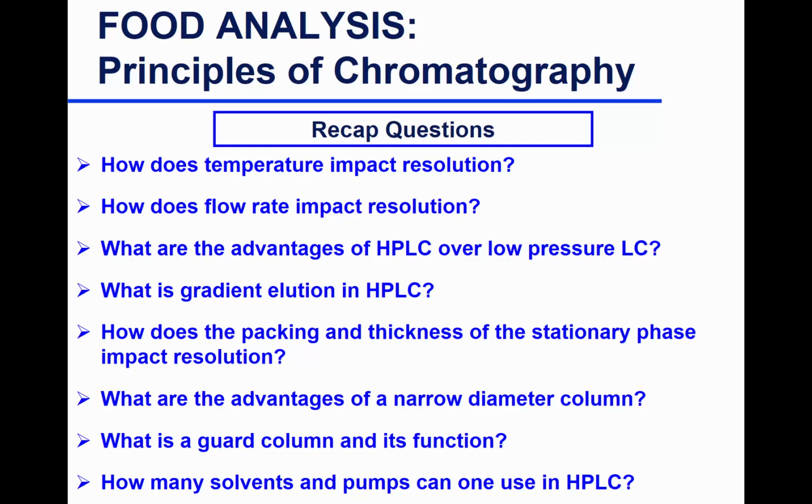It's not always in one direction. If you have a reverse phase chromatography, increasing the strength would be increasing the acetonitrile or methanol or organic solvent concentration. However, if it's normal phase, you would increase the concentration of your polar mobile phase. Most often would be water. So depending on the anion exchange, it would be changing the pH, increasing the salt.